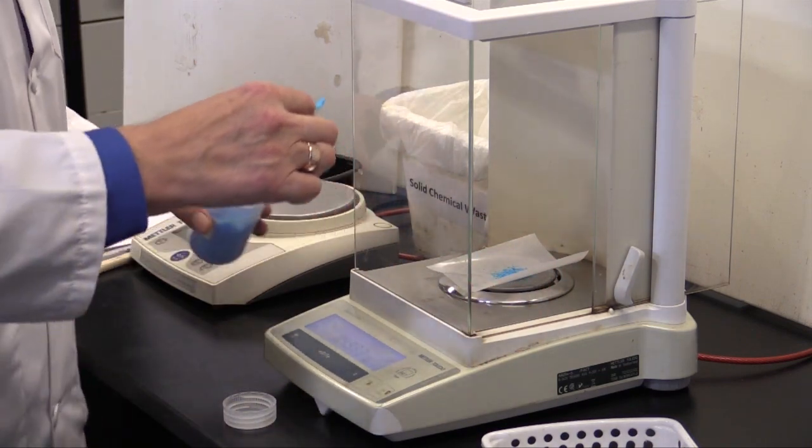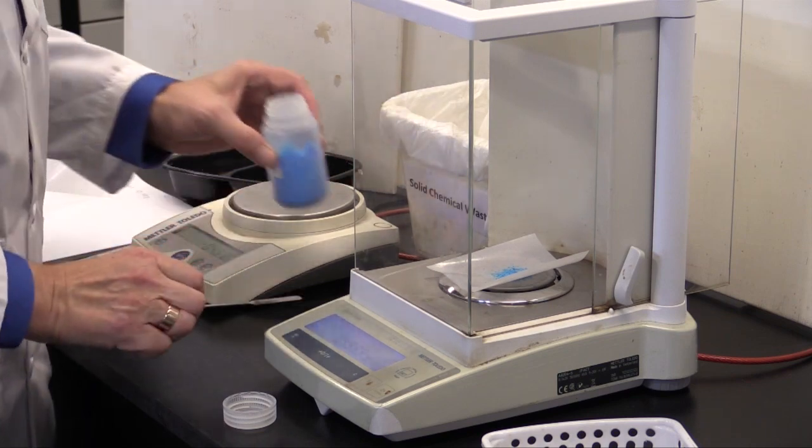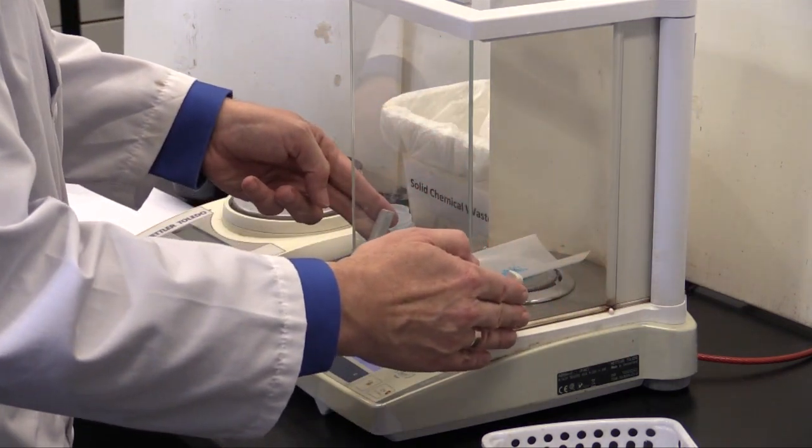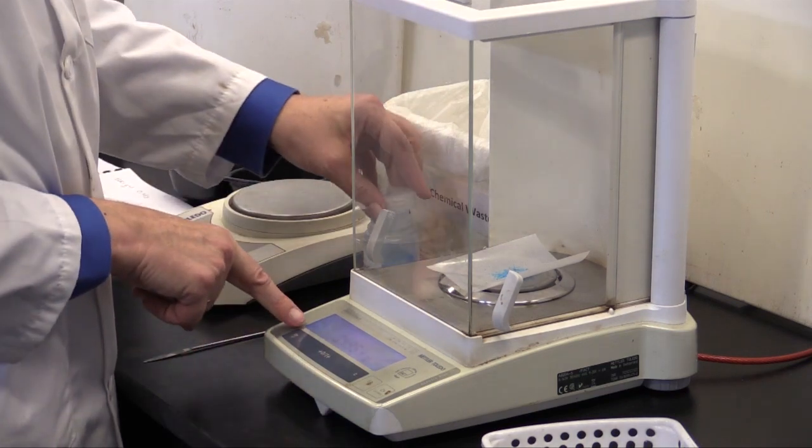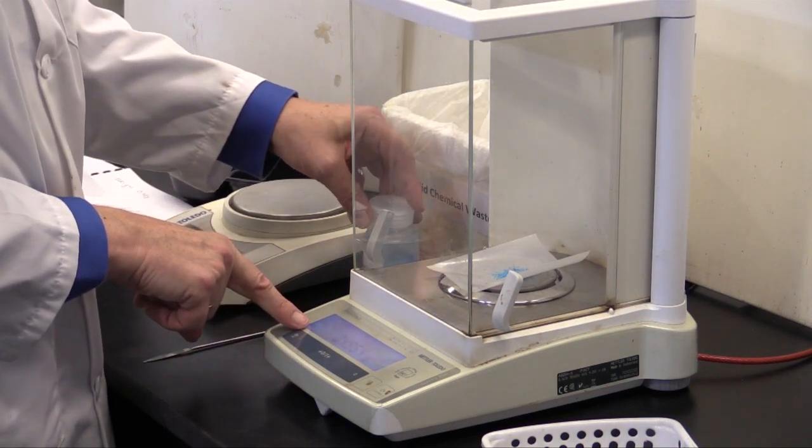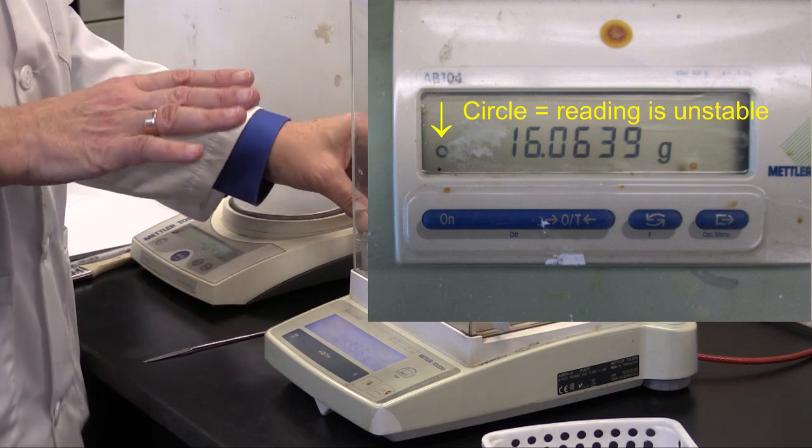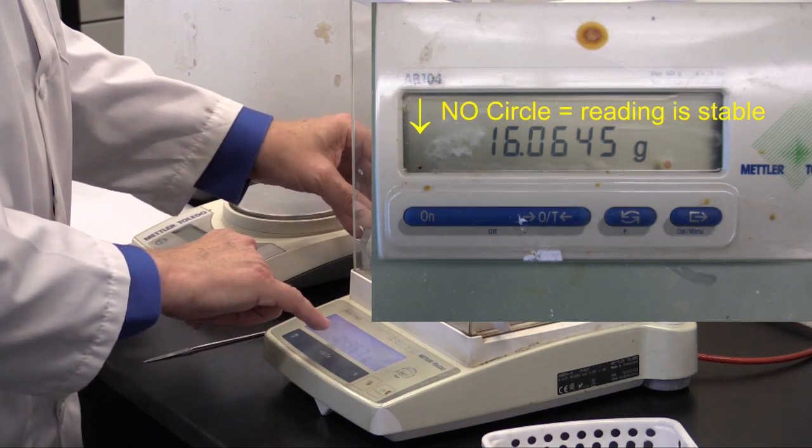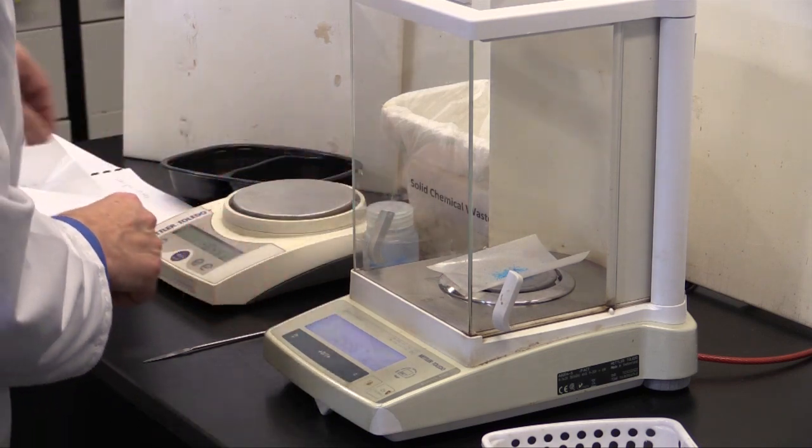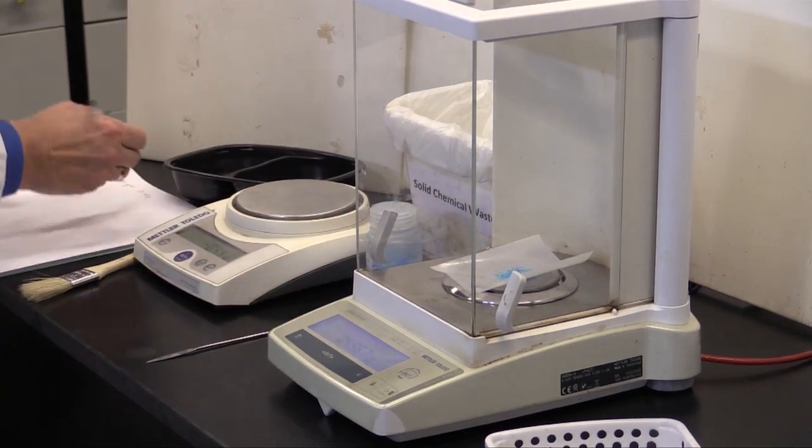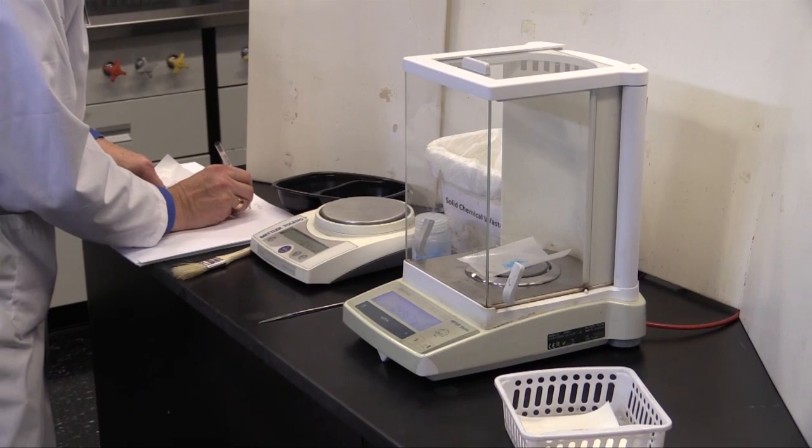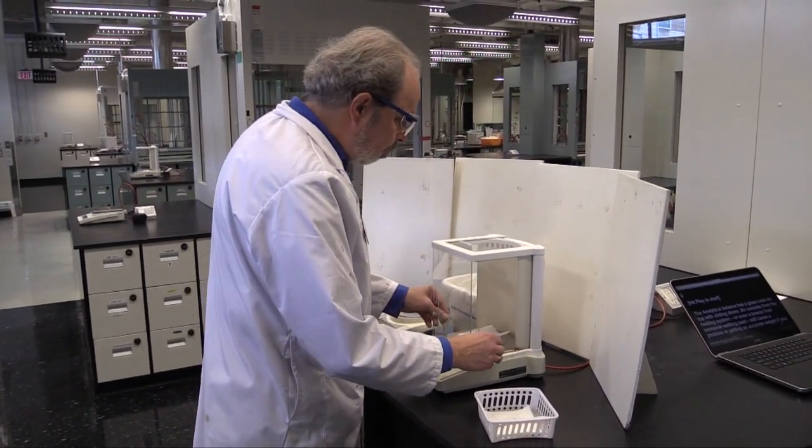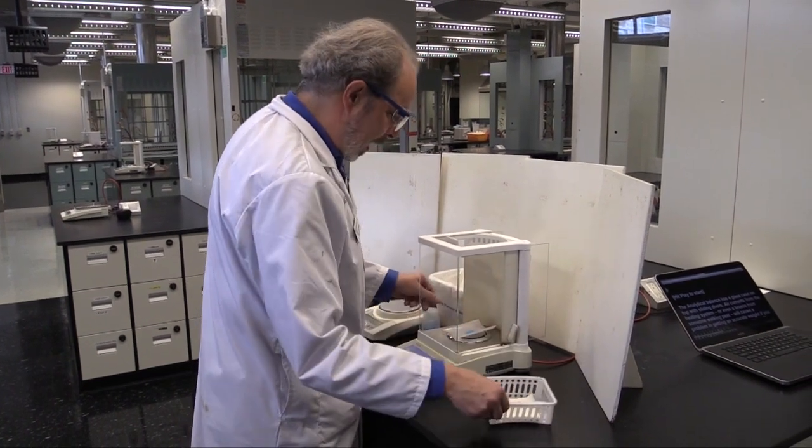And again, it doesn't go back into the bottle, but rather into the solid waste container. Now I close this and wait until this zero circle here goes away. When the circle is present, it's an unstable reading. When the circle goes away, it's ready to read. And that's 0.4967 grams. And again, write that down, 0.4967 grams.